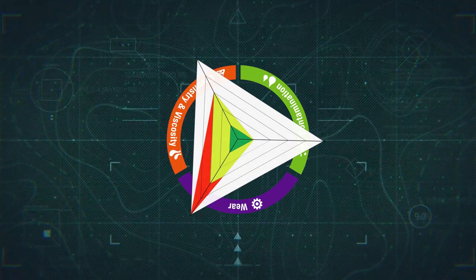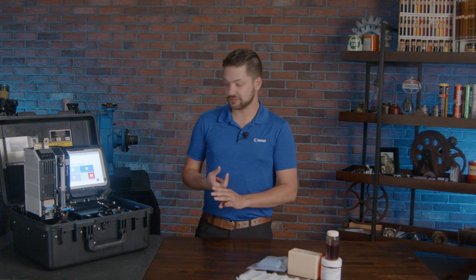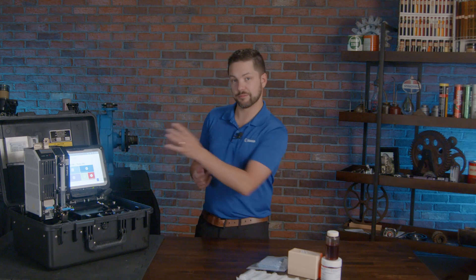This technology has the ability to look at all three key areas of oil analysis: wear debris, contamination, and fluid chemistry. With wear debris, we can pick that up with the XRF, which is X-ray Spectroscopy Technology.